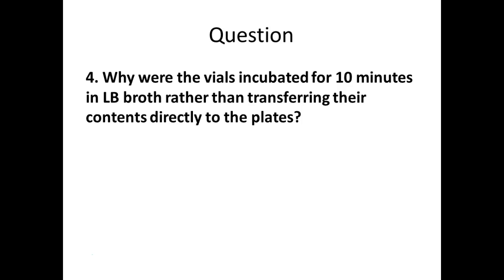That plasmid, what information does it have on it? What genetic information do we give them? The BLA, the beta-lactamase enzyme. Are they going to make it? Yeah, they better, because guess what? Some of those plates we have contain ampicillin. If they don't make it, what's going to happen to them when we put them on that plate? They're going to die. So in this time frame, they're going to make the beta-lactamase enzyme so that they'll be able to survive in the presence of ampicillin. Remember, that one's not under control.